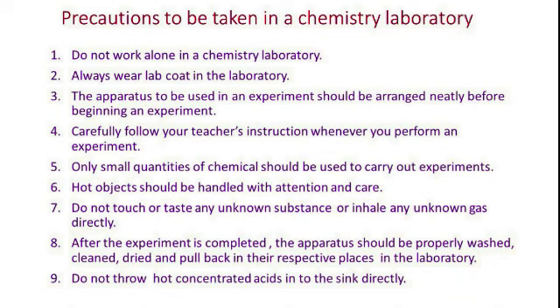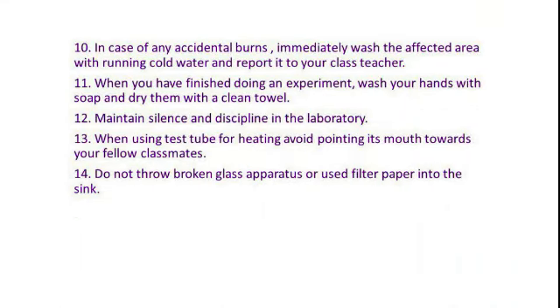And make sure that water is running into the sink so that when you throw away anything into it, it is safely washed away. In the case of accidental burns or skin contact with a corrosive chemical, immediately wash the affected area with running water and report to your teacher. When you have finished doing the experiment, wash your hands with soap and dry them with a clean towel. And always maintain silence and discipline in chemical laboratory.